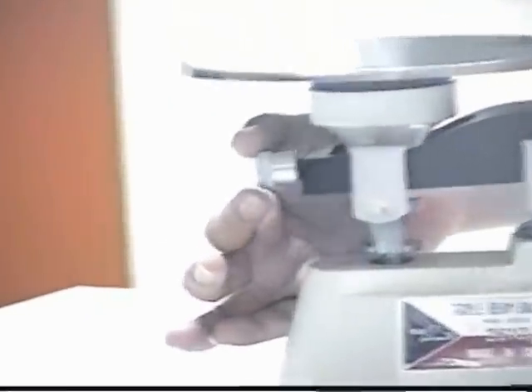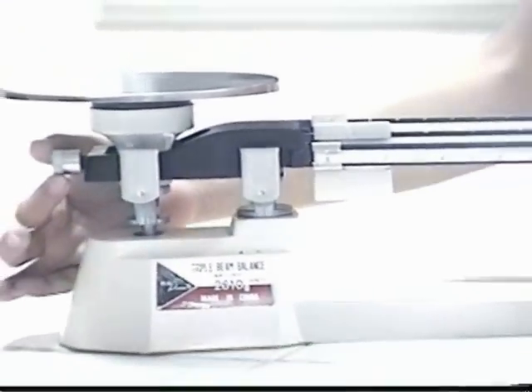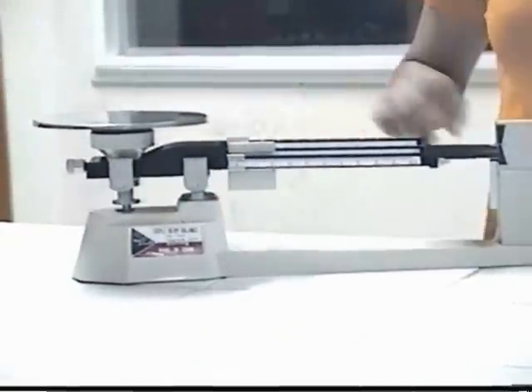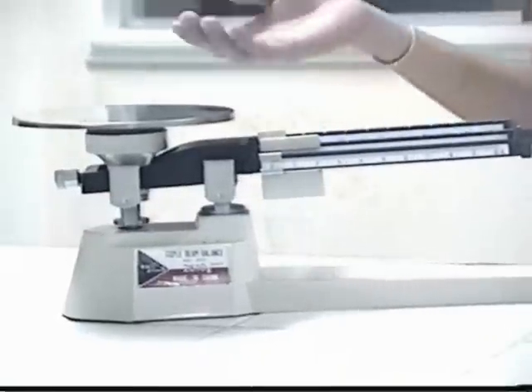Then use this Adjustment Screw to obtain an equal swing of the beams if necessary. By the way, you do not have to wait for the pointer to stop at the zero point. The beam should swing an equal distance above and below the zero point. You must repeat this zero procedure every time you use the balance.